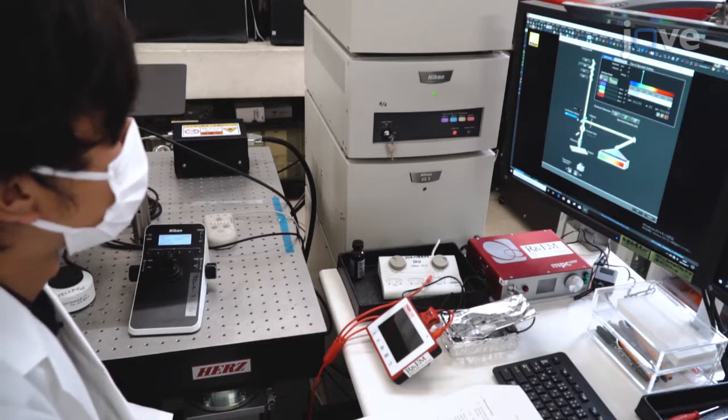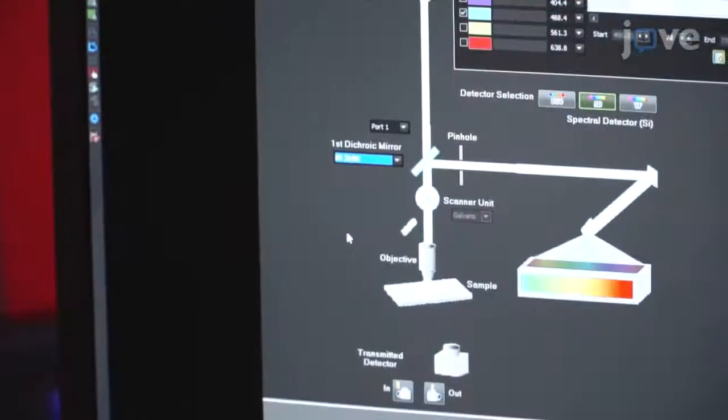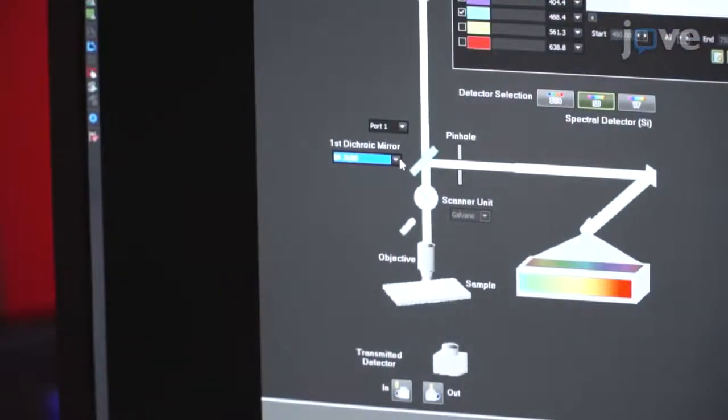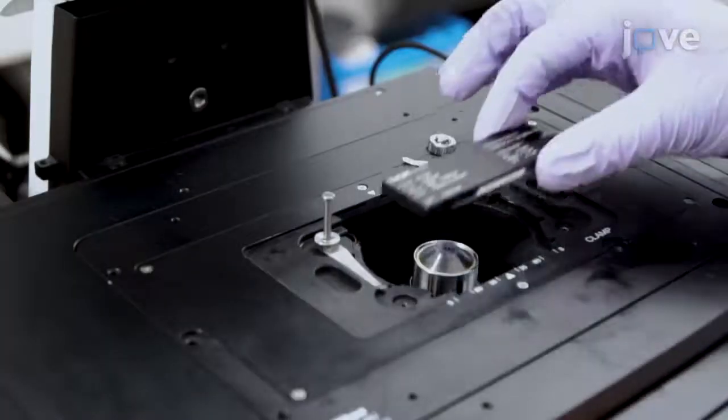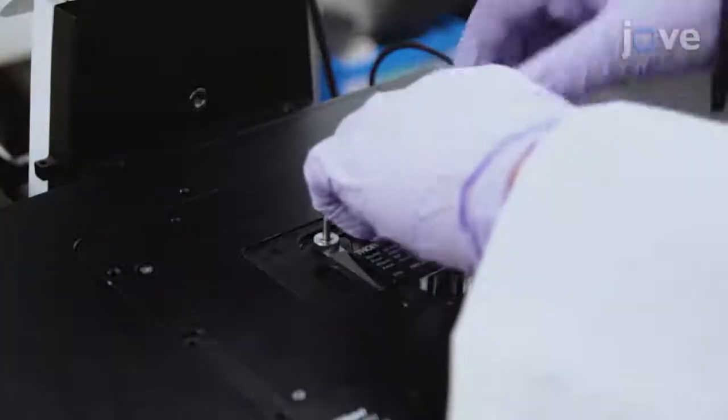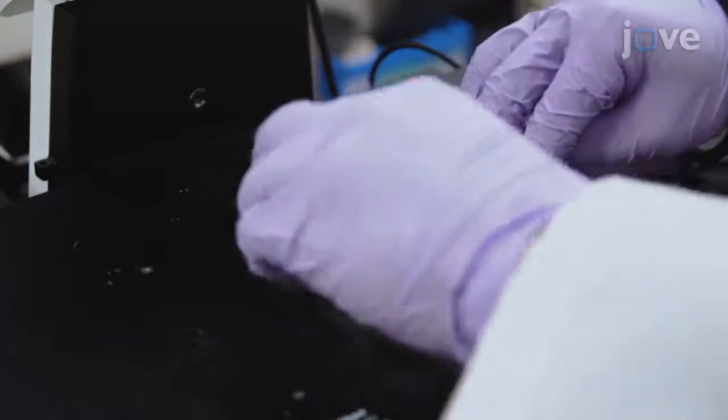For multichannel confocal spectroscopy, equip the microscope with dichroic mirrors and use a laser power meter to adjust the illumination intensity for each excitation wavelength.